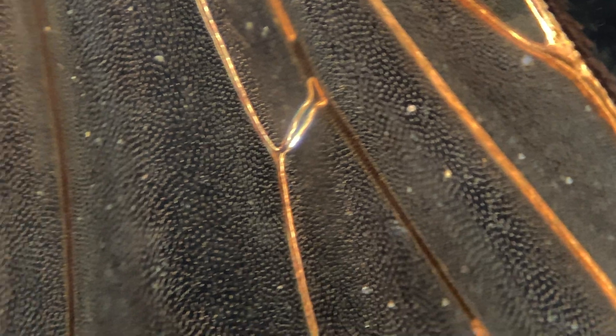And this is kind of the main difference between housefly wings and butterfly wings. Butterfly wings are covered in scales, and the scales are a lot prettier, in my opinion at least, than these hairy wings.